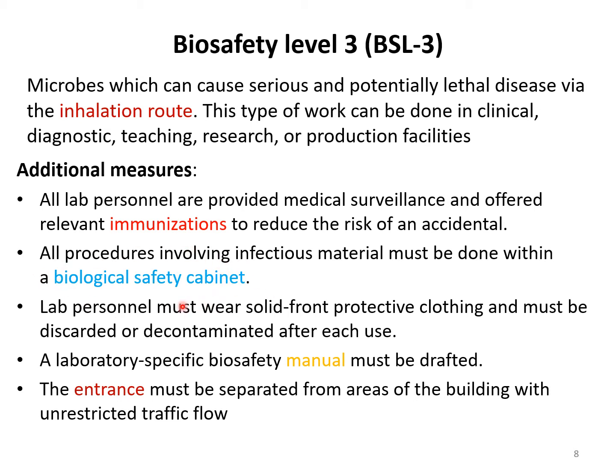So we will not use open benches or any other cabinets or hoods. Lab personnel must wear solid-front protective clothing and it must be discarded or decontaminated after each use. And of course, a biosafety manual must be drafted.